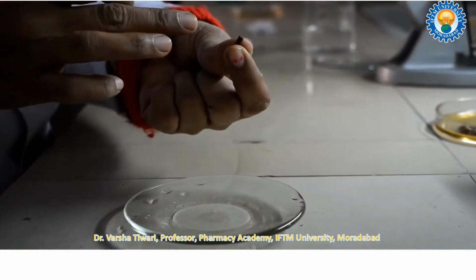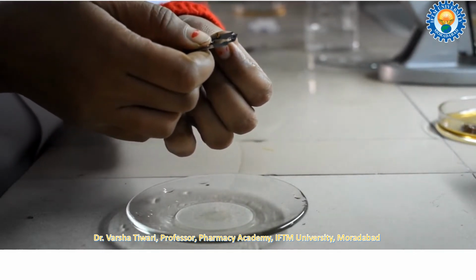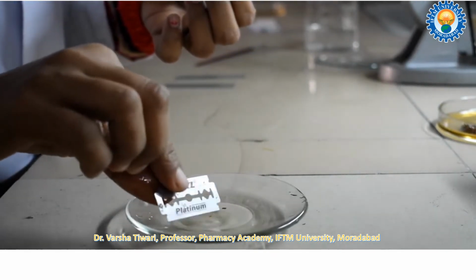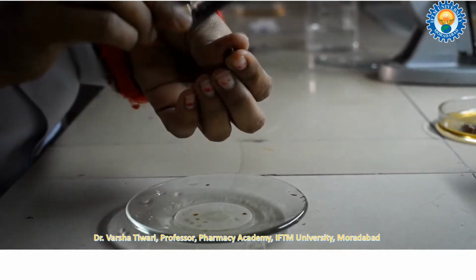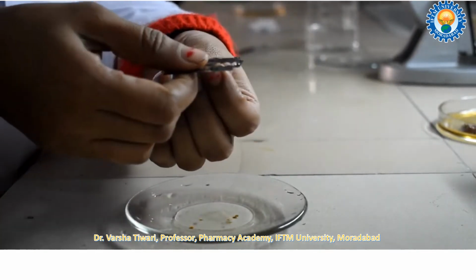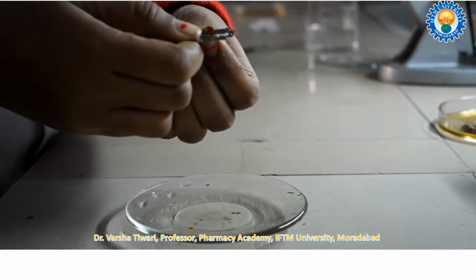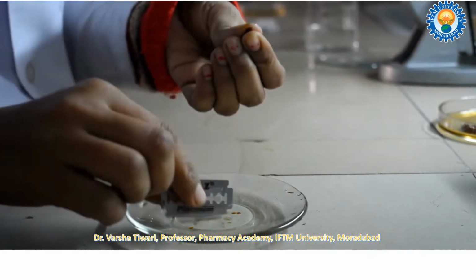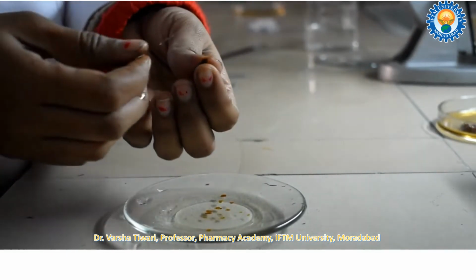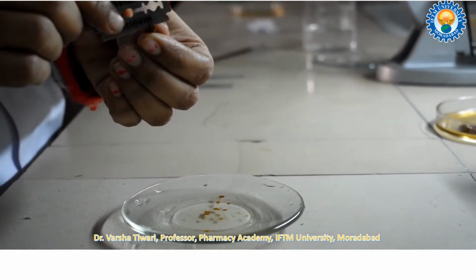Hold it between the index finger and the thumb, and now we will cut the sections. You are not going to do it like this, you have to do it like this only. See how many sections are coming. So you have to select a thin section. We have to cut the sections till here because the ovaries will be here only.